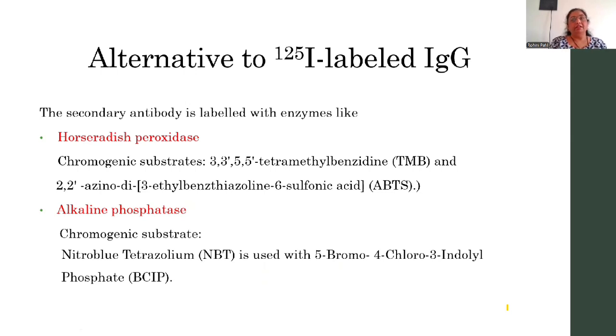Now the radiolabeled ones are hazardous. That's why there has to be a safer mode for the detection. And for that purpose, the secondary antibody is labeled with enzymes. The enzymes which are used are horseradish peroxidase and alkaline phosphatase.